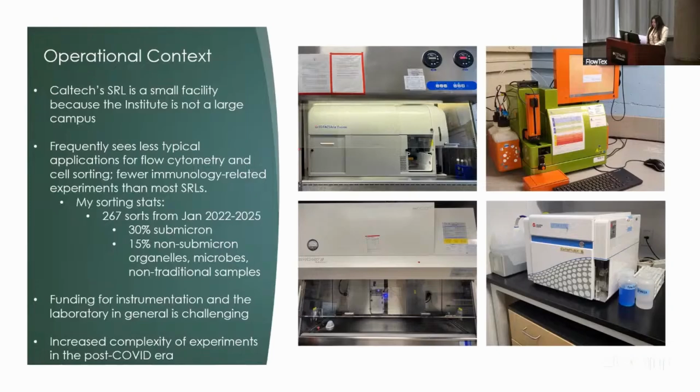Typically the recommendation for submicron sorting is that only one operator runs the instrument and that it be dedicated only to those experiments. But in most SRLs, that's just not realistic. So what makes this facility stand out is that we accepted the experiments and found ways to work around those challenges.